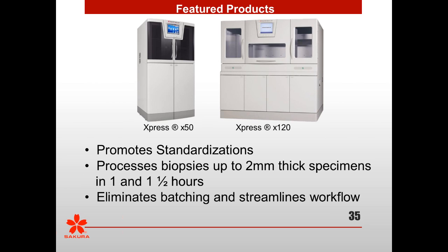Thank you, Bill. And just to follow up on that question, the specifications for grossing are exactly the same whether it's animal tissue or human tissue. So using the standard processing protocol, no larger than 2 millimeter sections. Using the extended protocol, no larger than 3 millimeter sections.